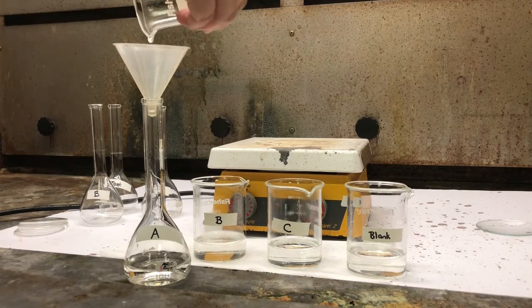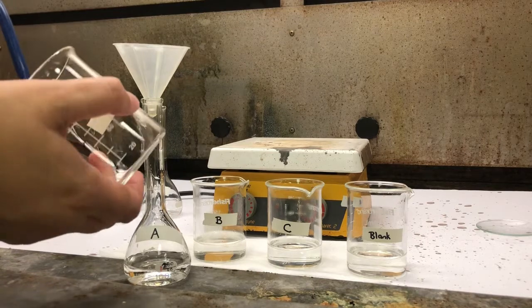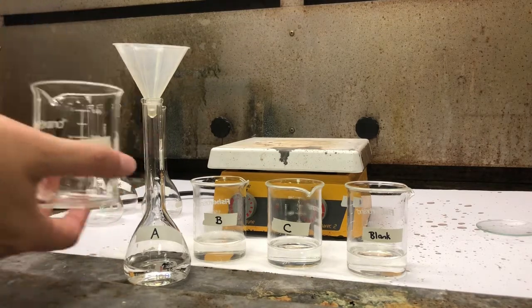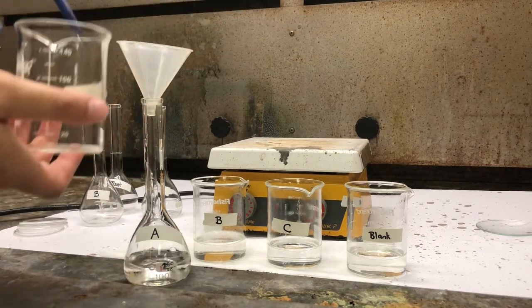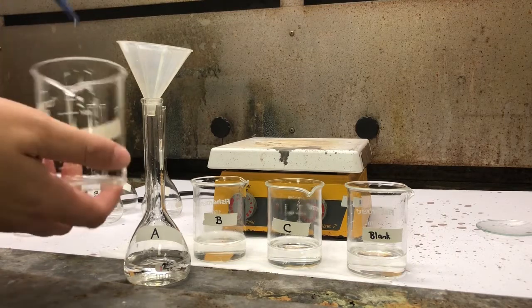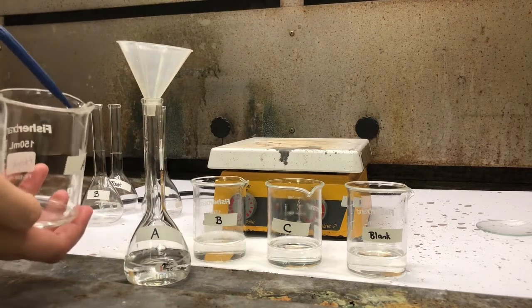We're going to rinse out our beaker with some deionized water and pour that in. Do that a few times just to make sure we get all of the material out.